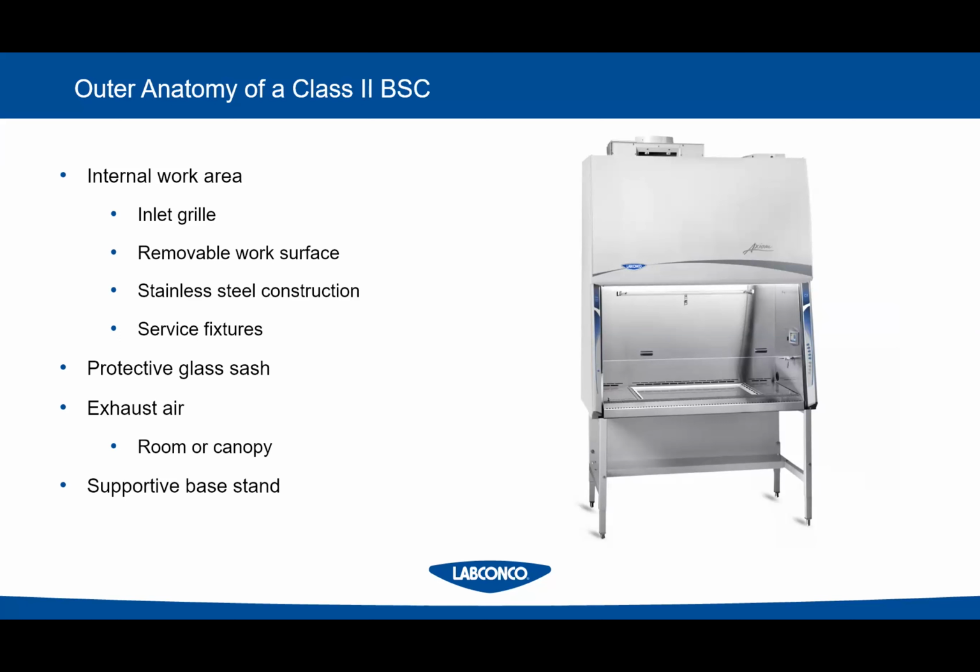And I take ergonomics a little further because to me, it's safety. If I'm uncomfortable or something's not right, I'm more likely to mess up and make a mistake. And you can take the best biosafety cabinet in the world, but if I'm working in there and all of a sudden I'm tired and I do this and stick my hands back in, I've just contaminated myself, right? So we want to make sure people stay comfortable.